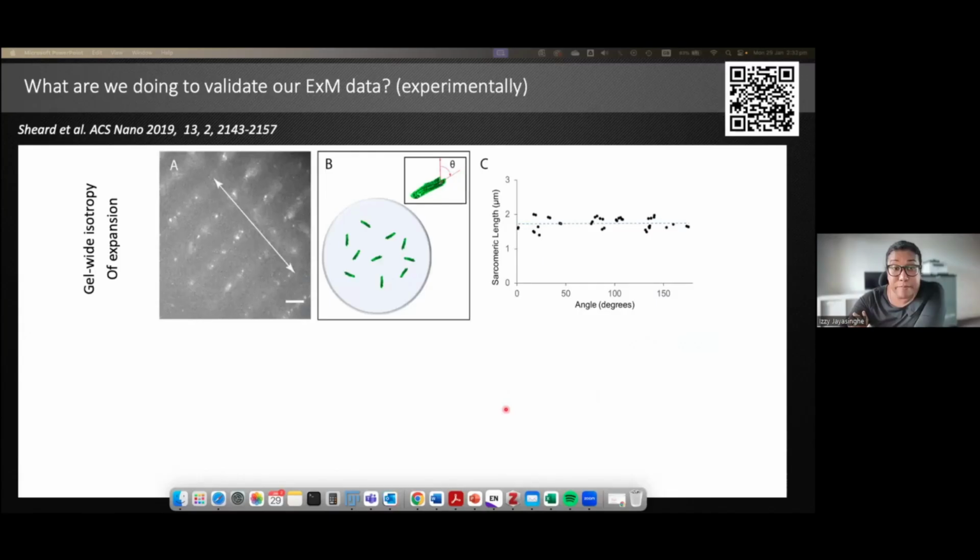When we started to do this, we were quite naive, but we had a system that was built into our samples that was a bit different. We were looking at muscle. So we had these intrinsic rulers in the form of sarcomeres, which are very stereotypic.